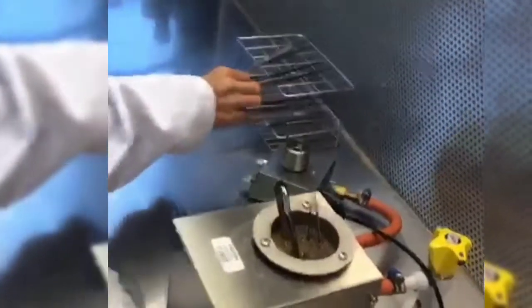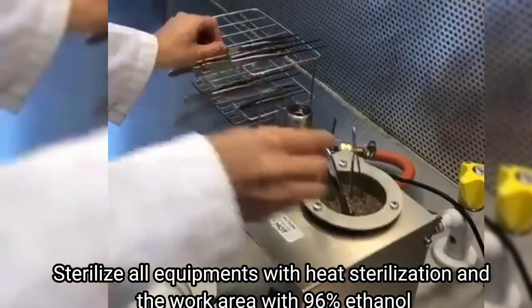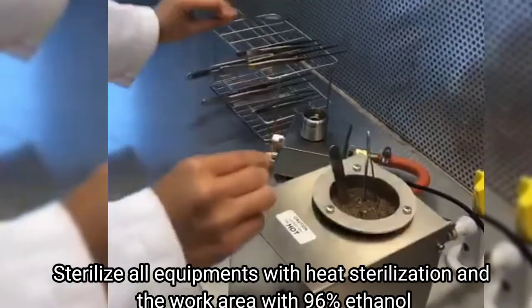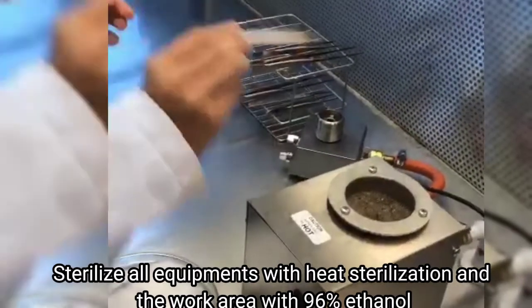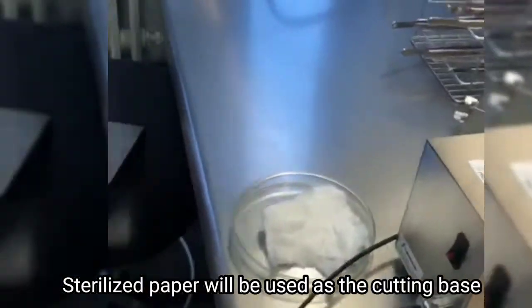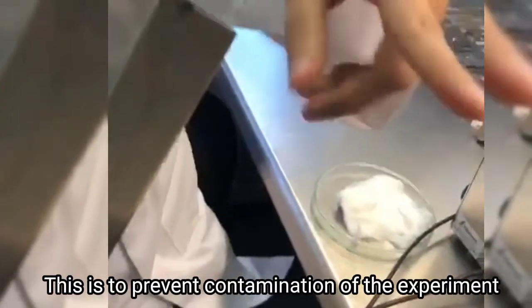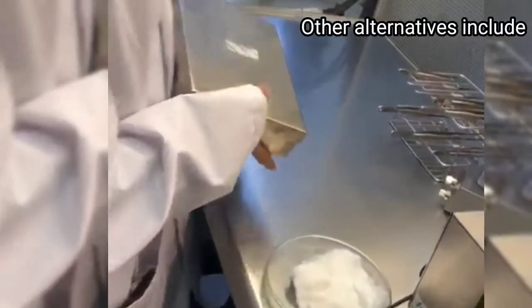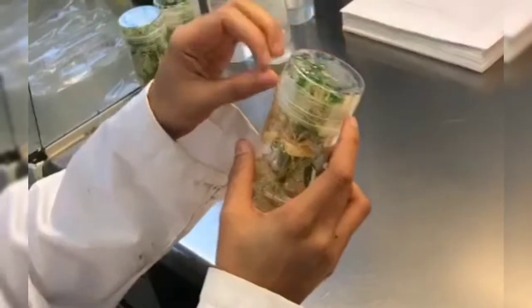Make sure that the experiment is conducted in a laminar air flow. You have to start with sterilizing all your equipment with heat sterilization and wipe the work area with 96% ethanol. Sterilized paper will be used as a cutting base to prevent contamination of the planting material or cutters. You can use other materials like sterilized tissue and filter paper as alternatives.